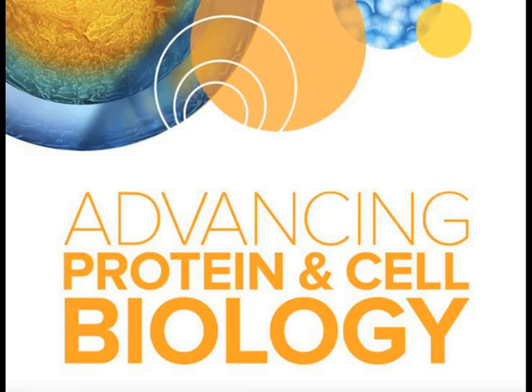Question for Steve. These are 2 related questions. Are there tools available to estimate cell or sphere location or distribution in 3D analysis, distribution of cells or other spheroids? And then the direct question is, can you perform distance measurements in 3D? So those 2 questions are a little bit related. Steve, can you take that? Sure. Yep.